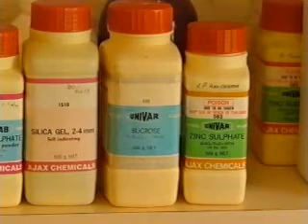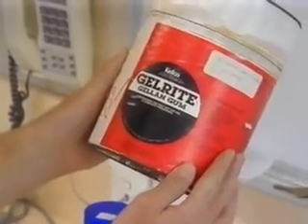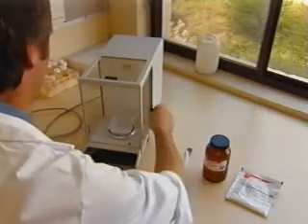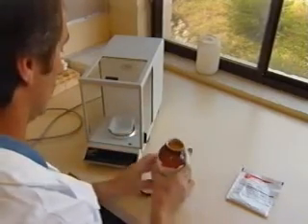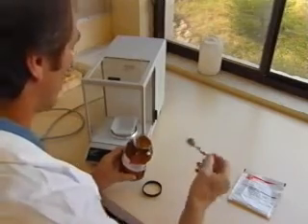The only things we need to add to this mixture will be sugar, plant hormones, and the gelling agents where necessary. If, however, we are doing a lot of media preparation with various combinations and permutations of minerals and organics, we may need to opt for preparing our own stock solutions and use them as required.